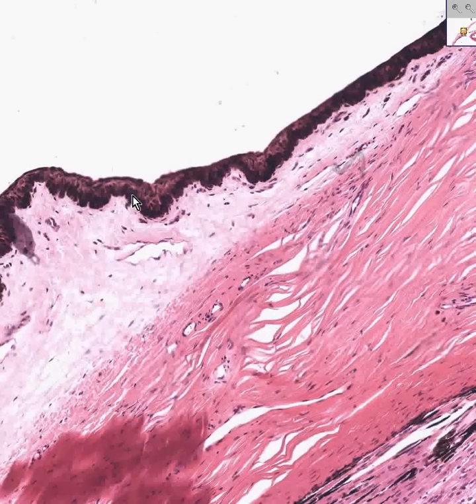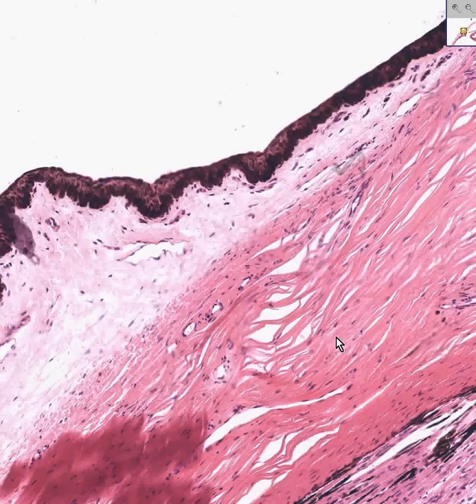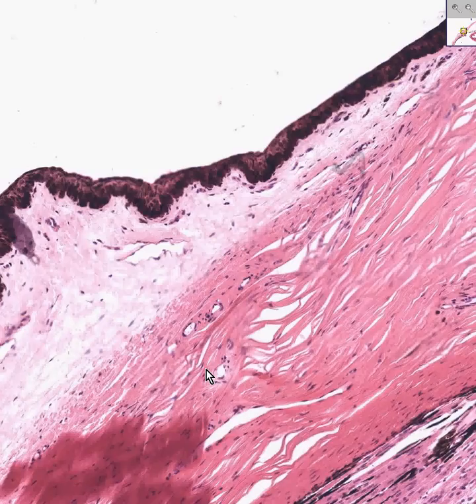And here's the bulbar conjunctiva of the sclera. And the sclera is also fibrous tissue, but it is not really as transparent as a cornea. I heard that if you blow through it with a soda straw, so you get warm air on it, it'll become quite a bit more transparent.